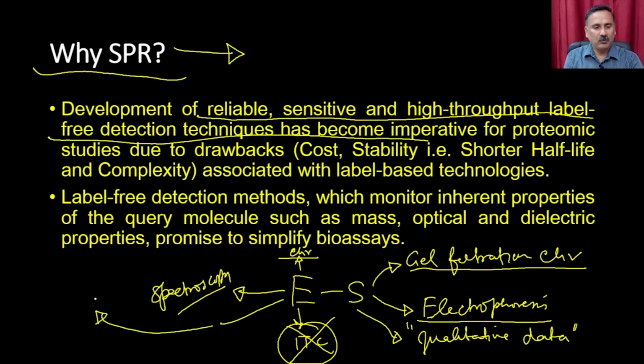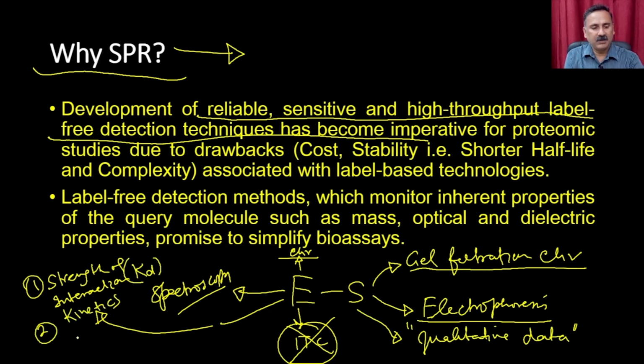It will not tell you about the strength of the interactions, number one, right? This means it will not give you very precise KD values. It will not tell you the kinetics, and most important, the majority of these techniques cannot be used for screening multiple ligands.